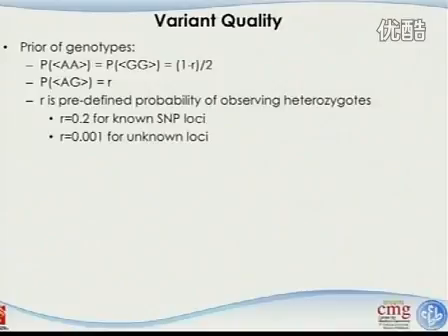And there's another piece of information we need. The Bayesian people like to have something called a prior, which means they make some assumption, which can never be proven right. They just assume it's right, and then calculate based on that, which sometimes is wrong.